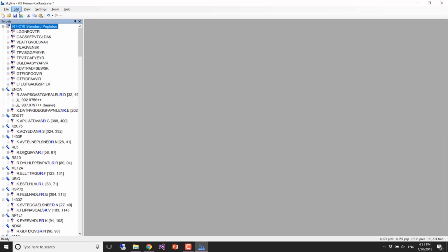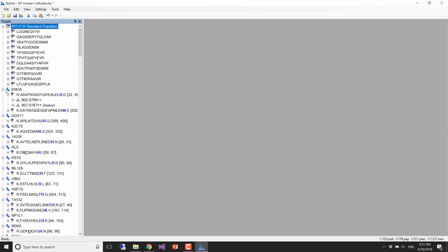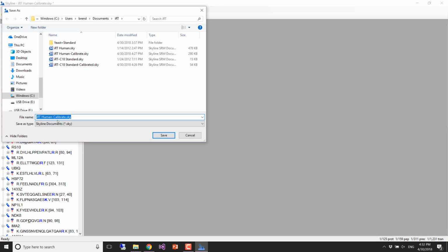So let's go to edit. Actually, before we do this, let's just quickly save this as something. File, save as, we'll call this human, I guess, calibrate 30. So go ahead and save that as calibrate 30.